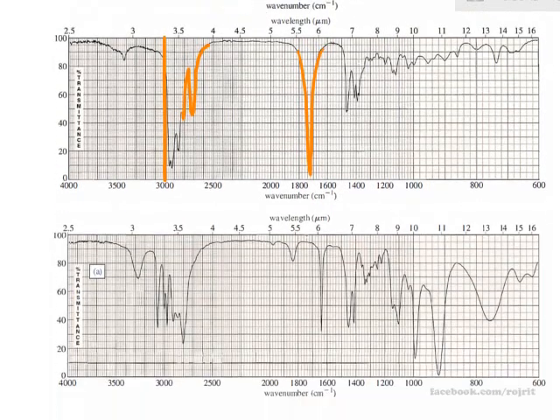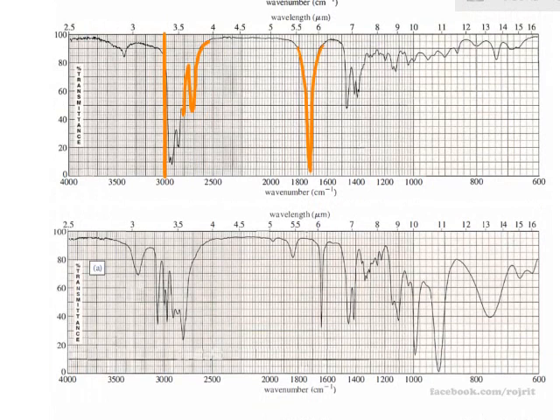Next, so many things here. You have peaks around 3000, so you have alkane and you have alkene. This is the alkene, 3000 something, and if this is the alkene, you have to double check with the C=C absorption at 1600 as well.